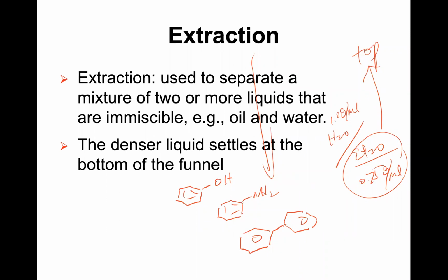So suppose we use a combination of water versus ethyl ether, right? In this case all are soluble in the ethyl ether. However, if you apply some acid, for example, add hydrochloric acid to the water solution, then the amine will be protonated. Then this will become soluble in water, but not soluble in ethyl ether now. So this one can go to the aqueous layer, and you will be able to separate that.